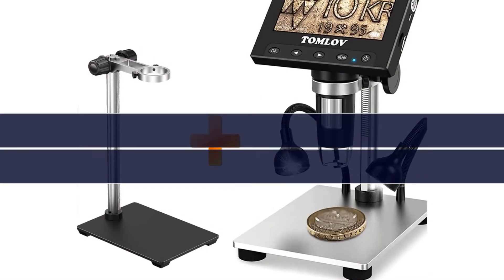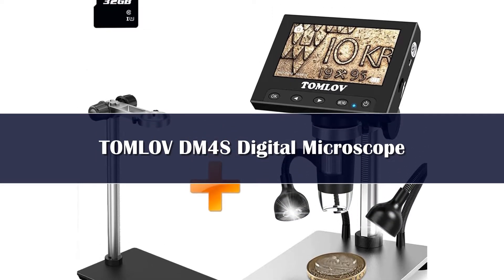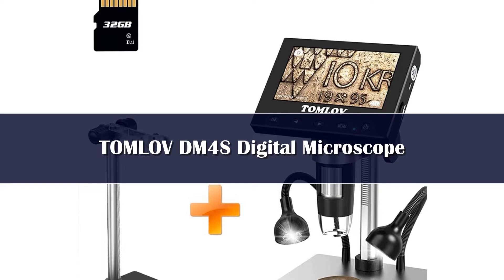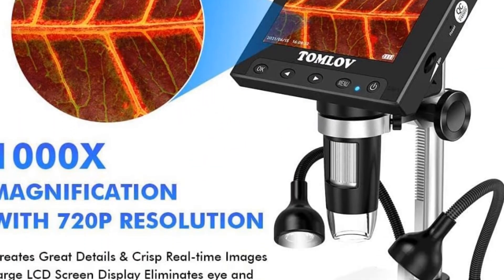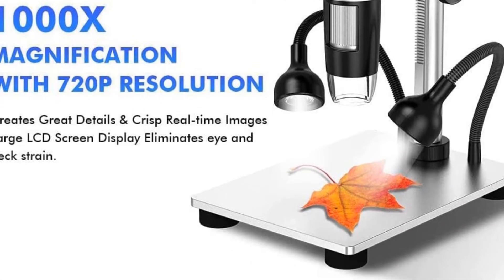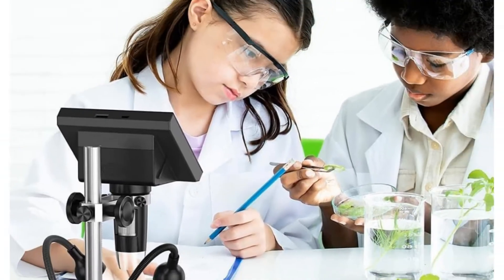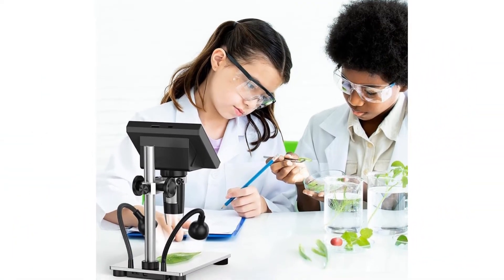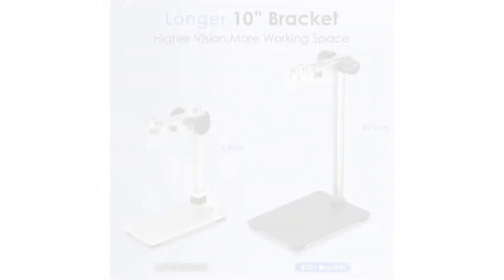Number 5. Not relying on Wi-Fi or signal, the LCD screen displays real-time crisp images and good quality videos with no lag or delay. The large screen enhances ergonomics and eliminates eye and neck strain compared with an eyepiece. The Tomlove microscope extension bracket comes with a 1.38-inch holder, which is compatible with USB digital microscopes including Tomlove, Elicalive, Optica, or other brand LCD digital microscopes.